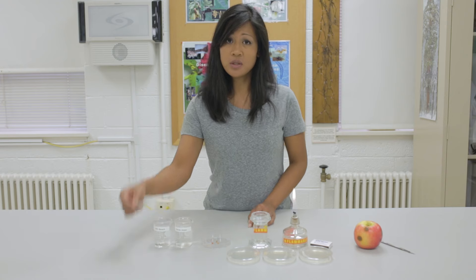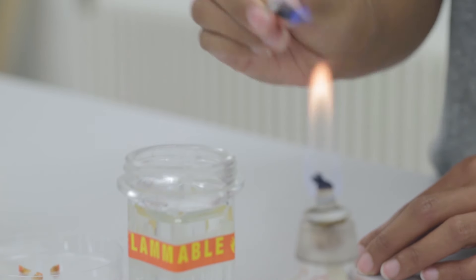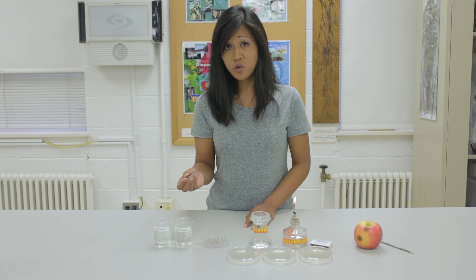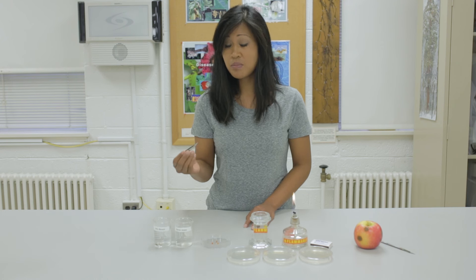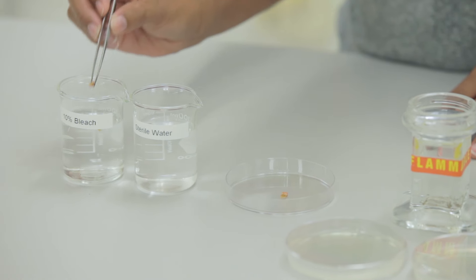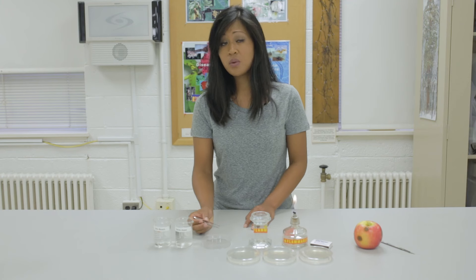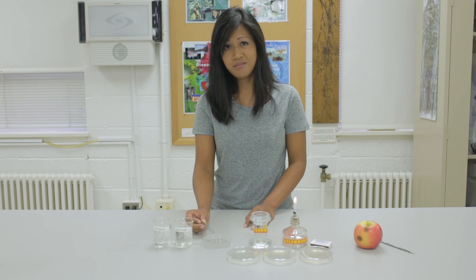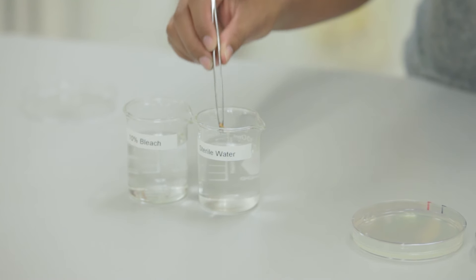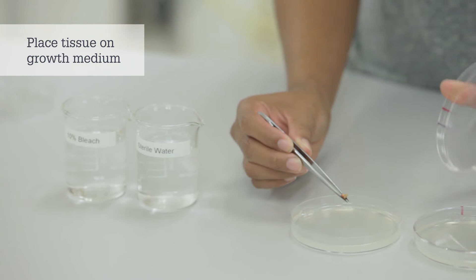The first thing we'll need to do is sterilize the forceps. Dip them into the alcohol, drip off the excess, and then hold them into the flame. Use the sterilized forceps to place the pieces of tissue into 10% bleach solution. They will sit in the bleach solution for 30 seconds. Using the forceps, remove the pieces from the bleach, rinse them in sterile water, and then place them onto sterile growth medium.